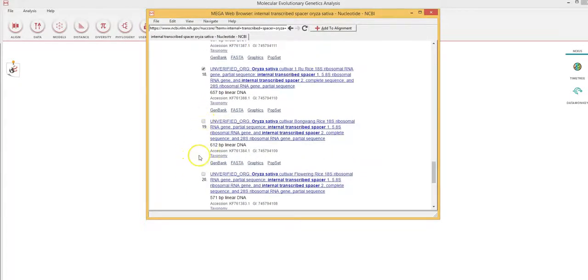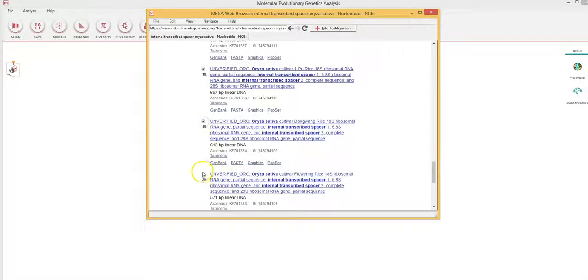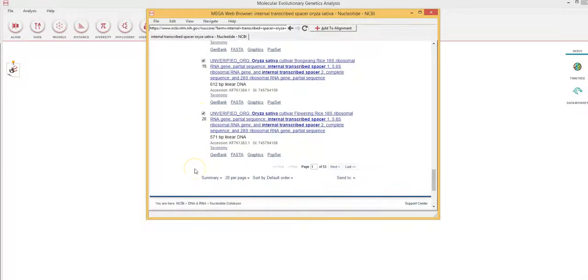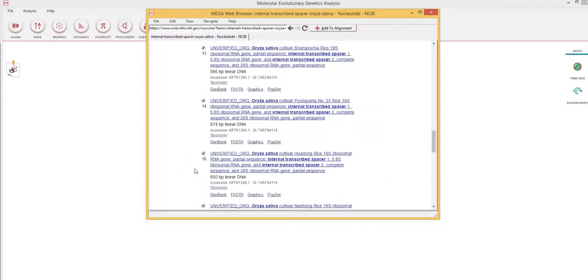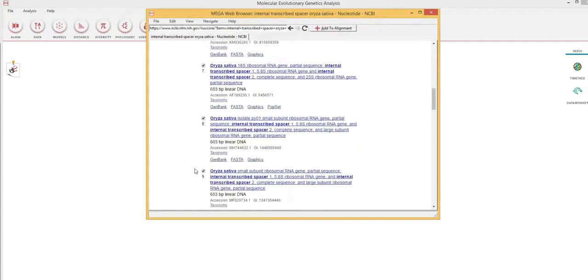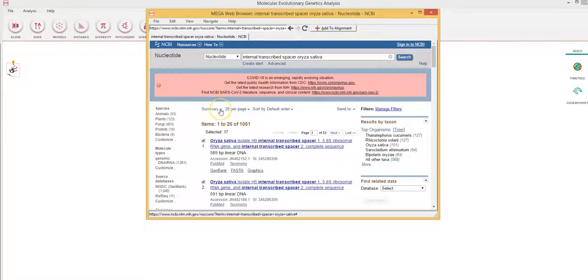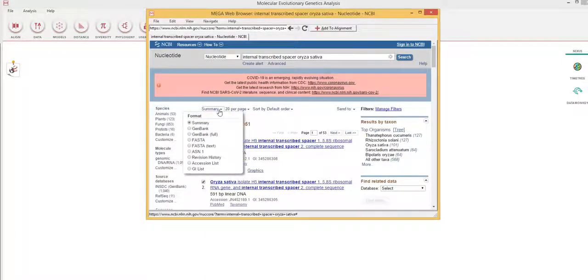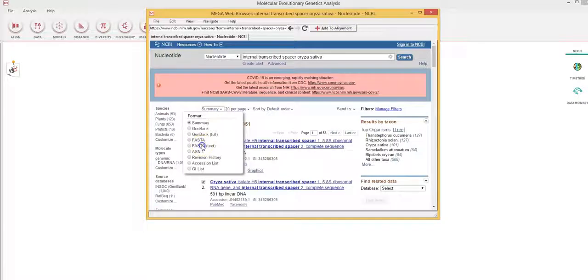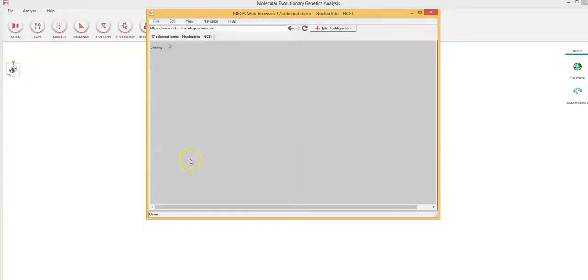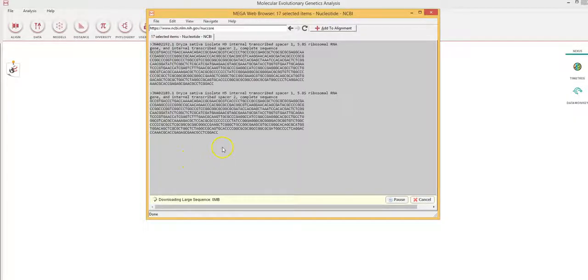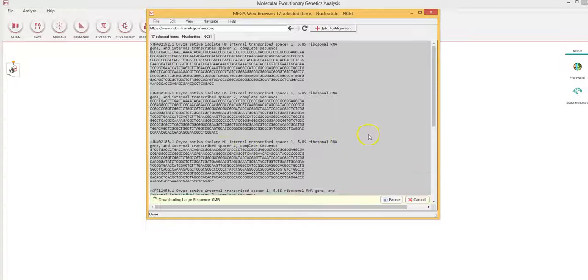Let me select these sequences. So I have around 19 sequences I've selected. And then I go up and I basically select here summary, scroll down, and you will see FASTA text. You need to select this in order to import these sequences into the MEGA 10 software.